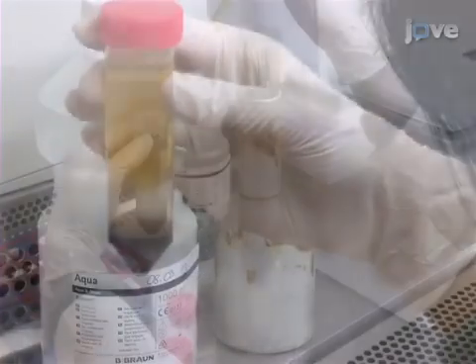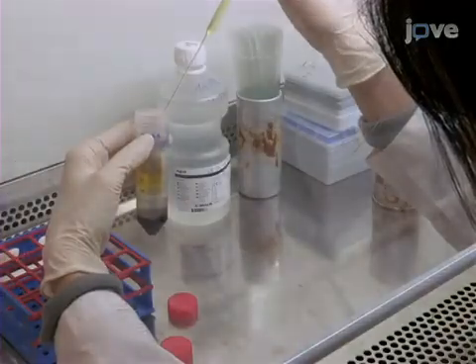After the spin, first aspirate the plasma layer, and then transfer the buffy coat.